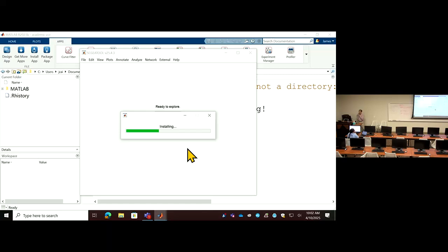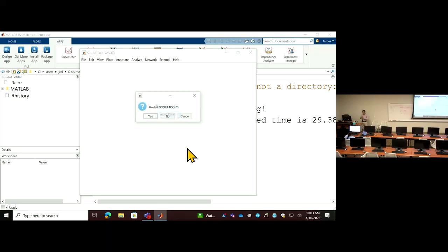So you don't have to search for the command line, the code. From now on, you just do this. Your package should be updated. If you have trouble finding these buttons, let me know, and I will go through the procedure again.